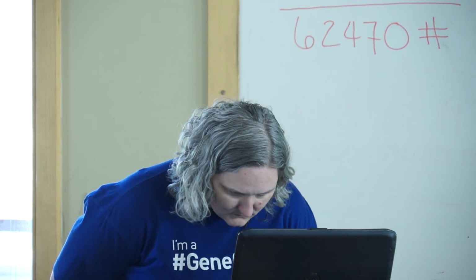If you don't have a computer, it runs approximately $1,000 or so to get one capable of running this. You may have one already, and maybe there are people who can get it cheaper than I can. So it's a little bit of an investment. It's not the cheapest sequencing platform, but it's nice because it's very portable, it's very small, and it's rapid and fast. We've seen vast improvement of the instrument over the last 2 years, and we hope to see more.